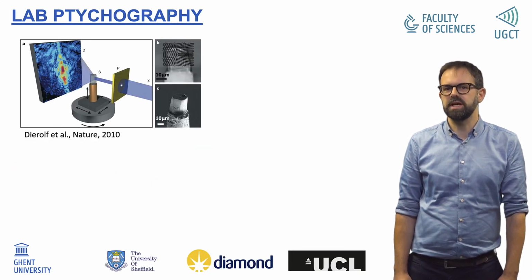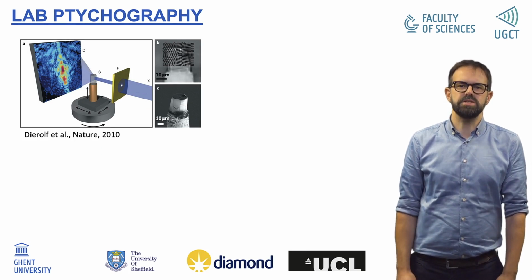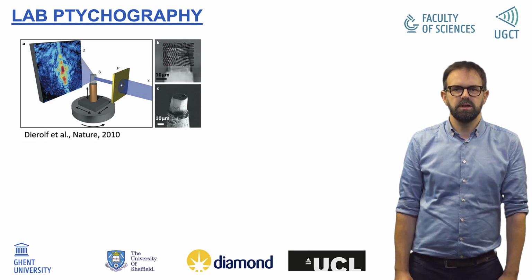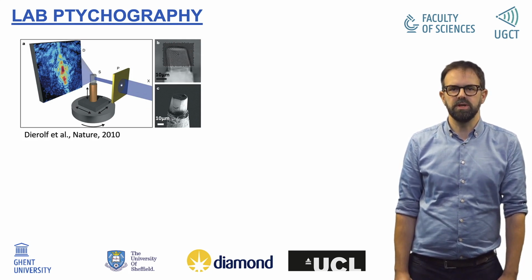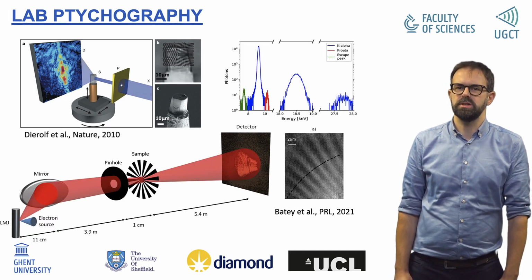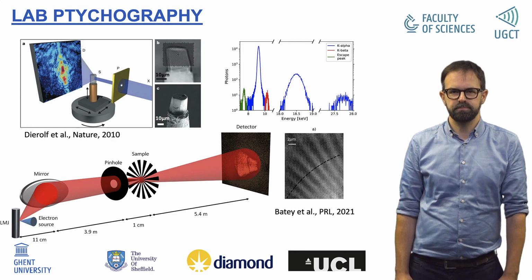The same small angle scattering effect is also driving a technique called ptychography. This technique enables much higher resolutions than standard X-ray imaging, reaching even 10 nanometers. However, it is currently only available at synchrotron facilities. Using novel instrumentation and in collaboration with several partners from the UK, we have proven it is possible to apply this promising technique at a lab facility.